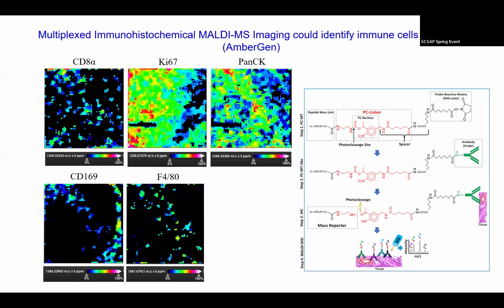Another thing we do is we have just started to set up immune profiling using imaging. This one we still use antibody. We use antibodies to identify each type of immune cell: CD4, CD8, macrophage, or B cell.